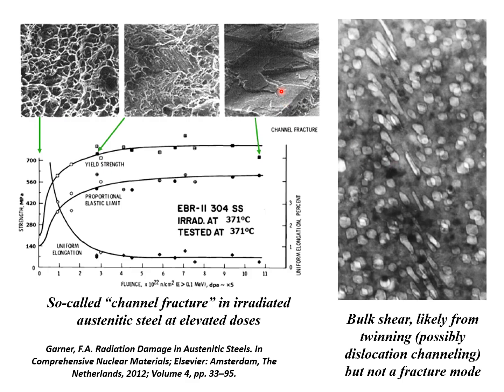And because in the same sample they saw evidence of shearing of cavities, like voids in the material that's in stainless steel, they put the two together, I think mistakenly, but they said, well, we get to this position and we also see this, so this must be caused by that. And that's not, strictly speaking, correct.